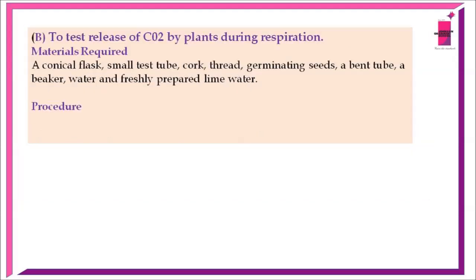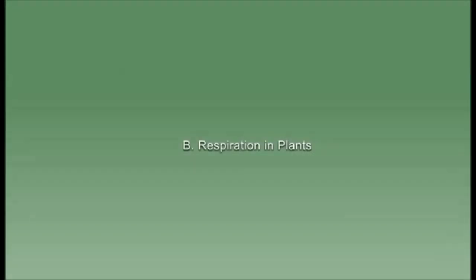To test the carbon dioxide release by plants during respiration. Materials required: conical flask, small test tube, cork, thread, germinating seeds, a bent tube, a beaker, water and freshly prepared lime water. Procedure. So here is the video. Observe the procedure carefully. Respiration in plants.